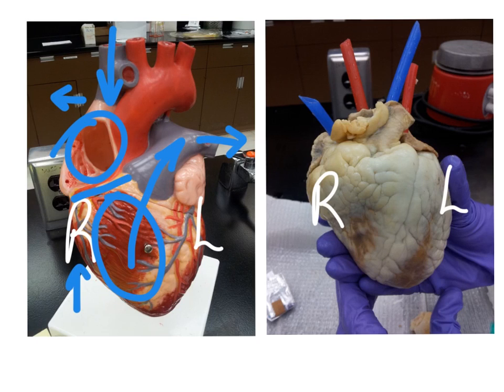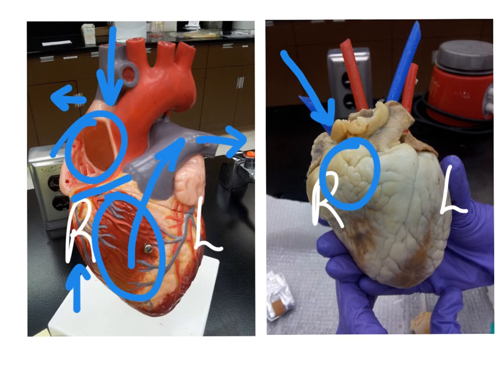Now looking at the sheep heart, the deoxygenated blood returning from the body would be coming in the superior vena cava, which you can't quite see because of the view, and also the inferior, which we'll look at when we look at the dorsal view. It comes into the right atria, goes through the tricuspid valve, into the right ventricle, and then right here is the pulmonary trunk, taking the deoxygenated blood to the pulmonary arteries, which will then go to the lungs to be oxygenated.